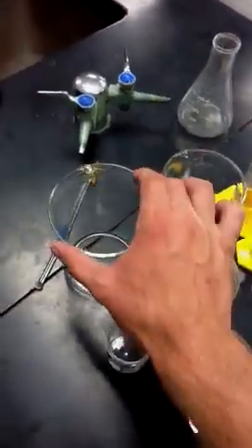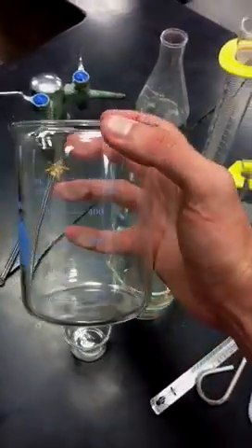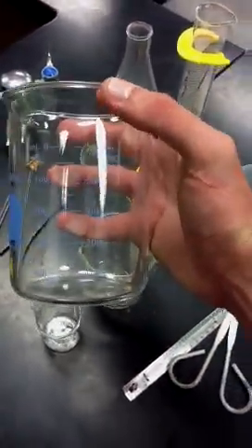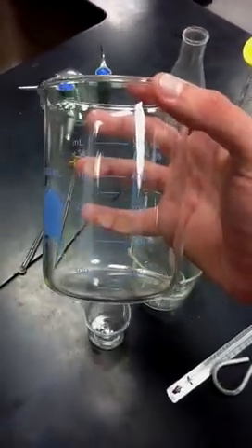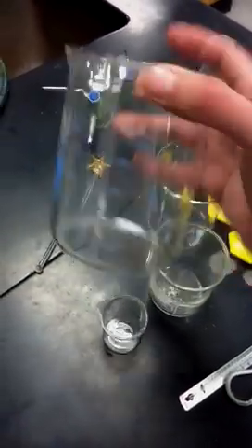And the big one here is a 600 milliliter beaker. It's got markings on the side to show you how much liquid it can hold and how much you have. So these come in handy.